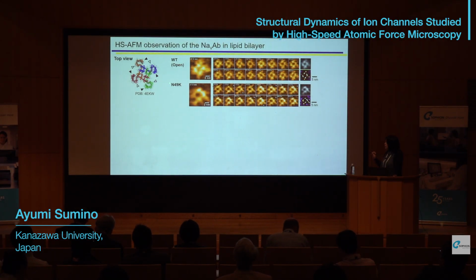The single mutant, having an intermediate voltage dependency, showed a very similar structure to the wild type, but several voltage sensors are missing in this mutant.